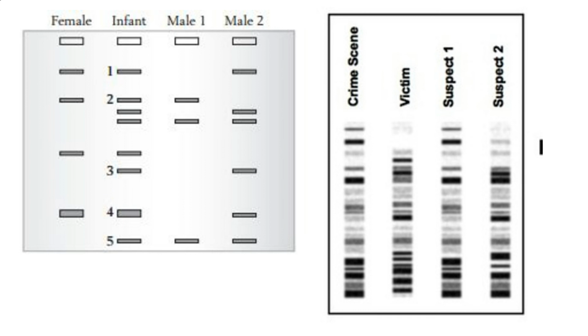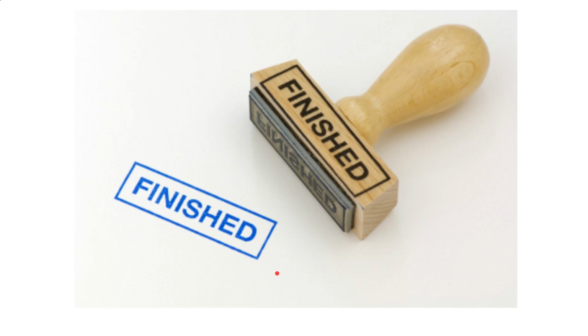Again, it's a way, with restriction enzymes, you cut apart the DNA, you run it through a gel to separate the different bits and try to make connections. You can do it for paternity, you can do it for crime scene analysis, but it also gets into looking for recessive disorders and different things like that, because there are different restriction enzymes that target different points of the DNA. But ultimately that's it for this. So we are now finished with that.